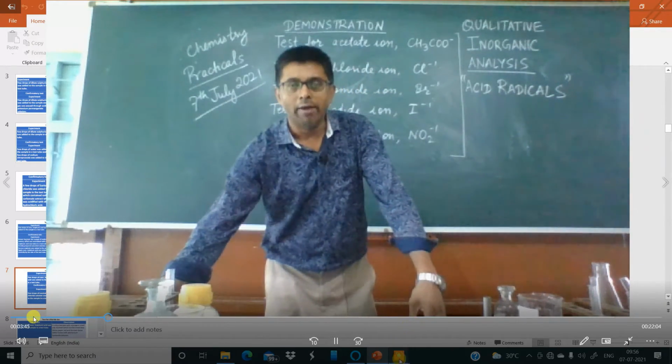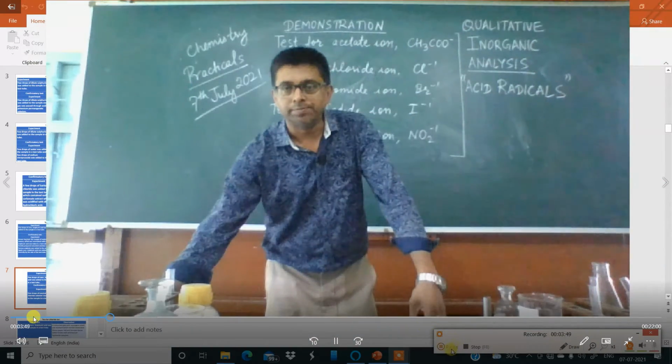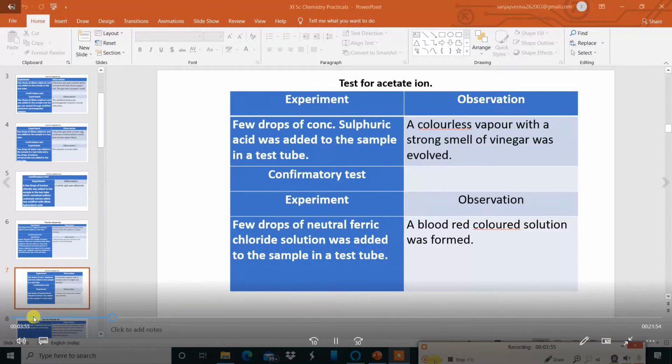Then after this I had shown you the test for chloride ion. The next sample was chloride ion. After the acetate, I had shown you the test for chloride ion.